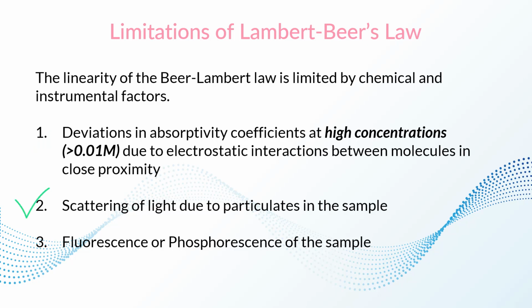Scattering of light due to particulates in the sample. If your sample is not clean, there are solid particles, there are particles which have significant colloidal range, they would scatter the radiation, and it is going to cause the deviation.